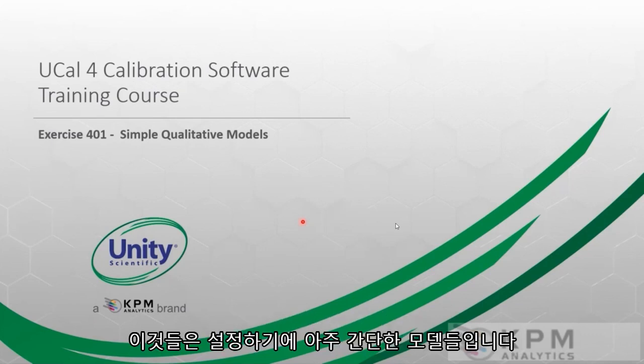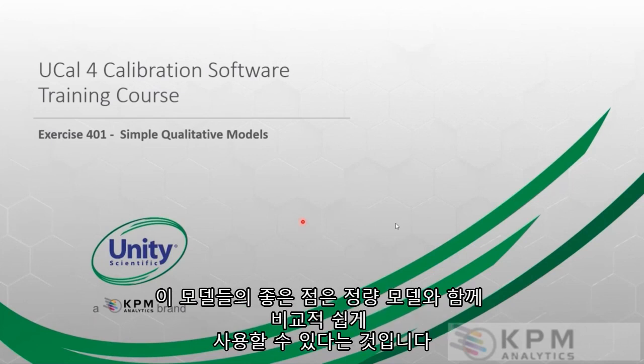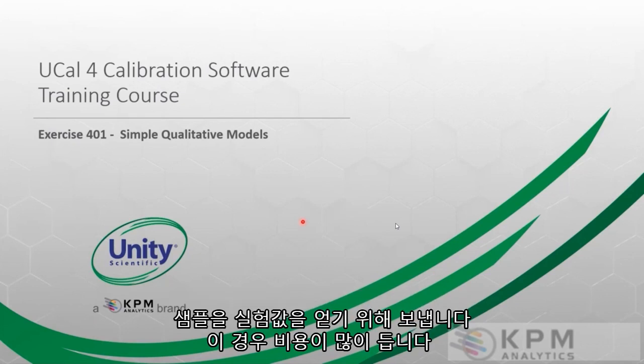So these are pretty simple models to set up. I think this is a little bit of an untouched area of near infrared, and it's growing significantly. A nice thing about these models also is that they're relatively easy to go in and try. With the quantitative models, we have to send our samples off for reference analyses, and often this is expensive.